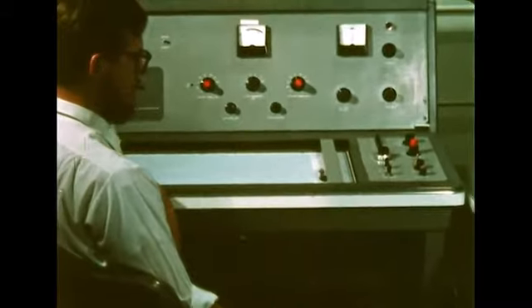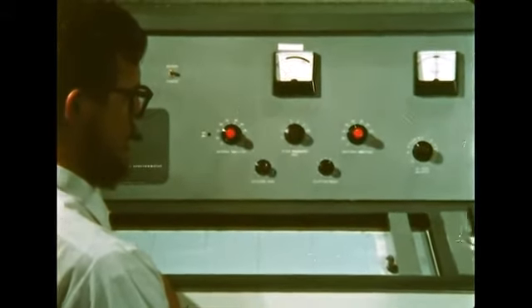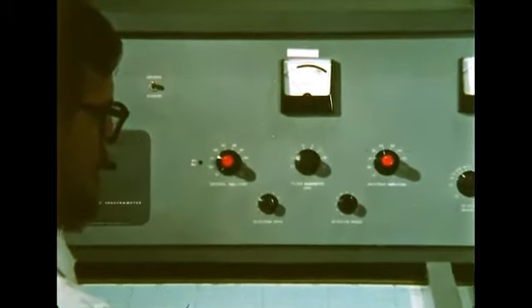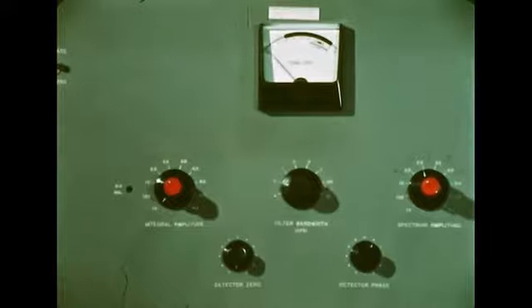Nuclear magnetic resonance, often called NMR, is a spectroscopic tool which has come to have wide use in structure determination and chemical analysis during the last few years. It can provide many kinds of information about the structure of molecules. This film gives an introduction to the theory of NMR and a few of its applications.